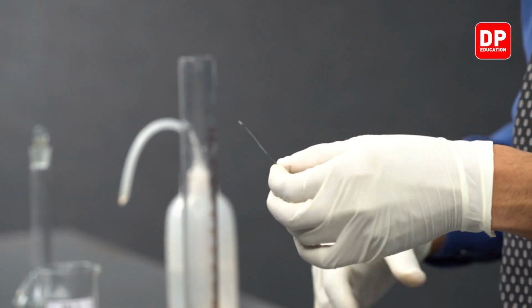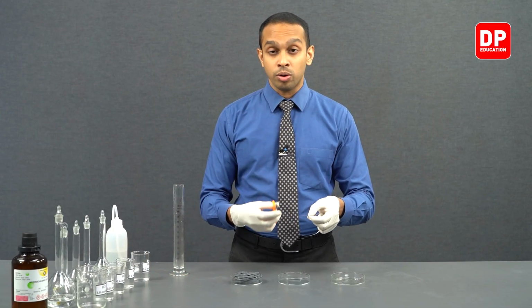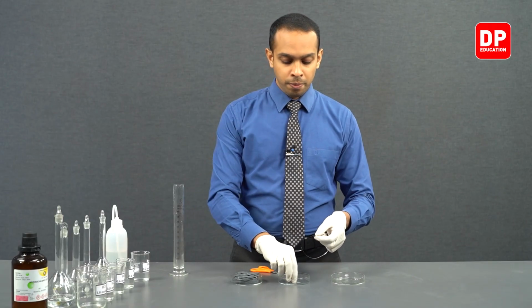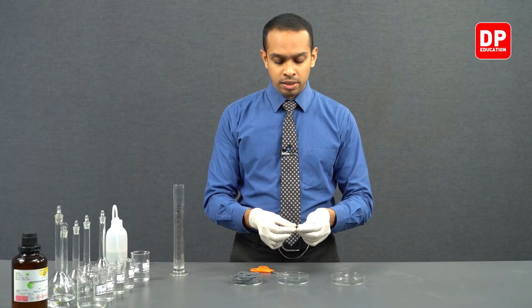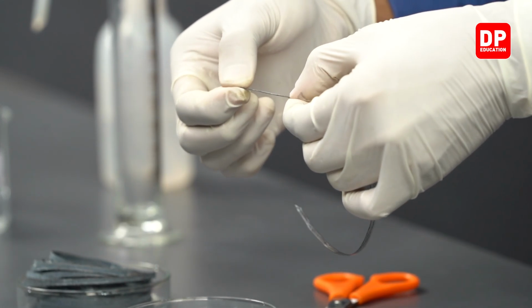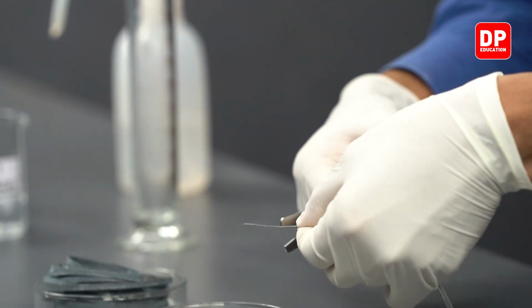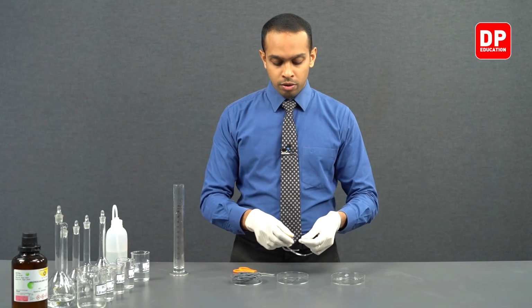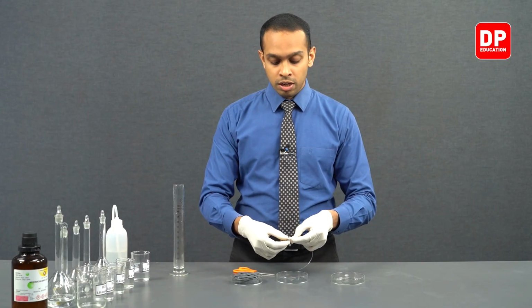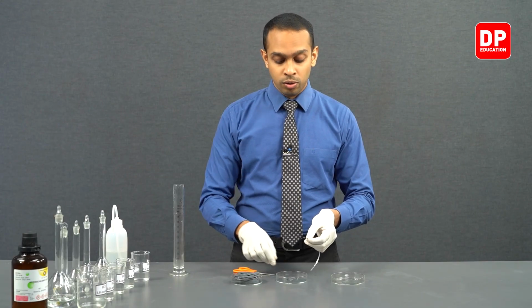We are going to measure about 4 centimeters of a magnesium strip that is already cleaned, and we can cut it using a scissor. And after that, we are going to make sure that we produce 5 other magnesium strips with the same length. We do this so that the magnesium surface that is exposed to the hydrochloric acid remains a constant.